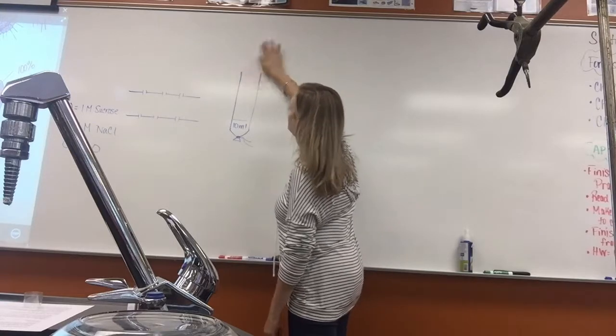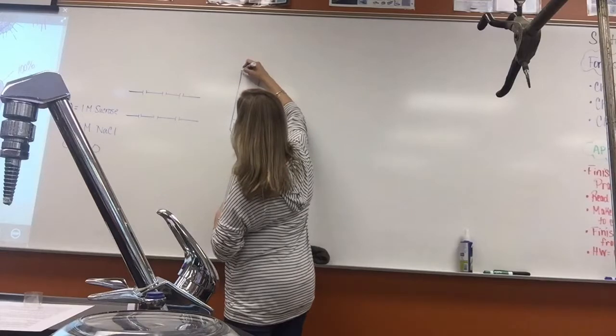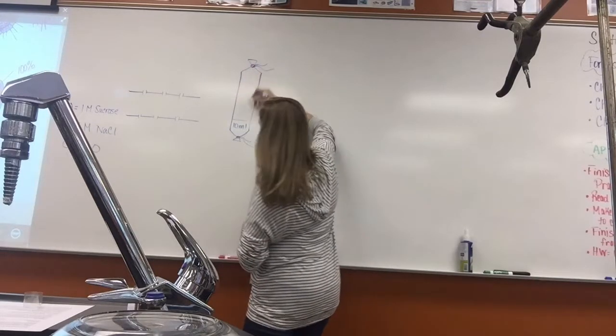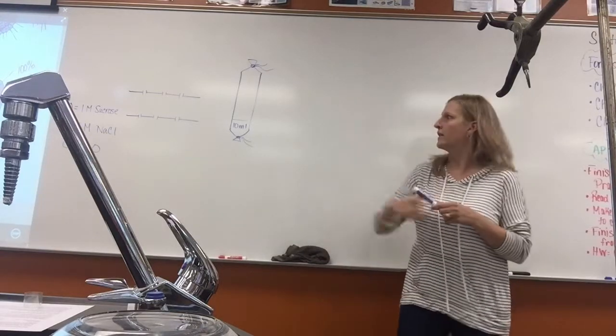So you're going to squeeze it out, take off the funnel there, and then once you squeeze out all the air, you're going to tie off the end, all right, over here. So therefore, you're going to have a lot of space in here. Why do you suppose that I want you to do that?